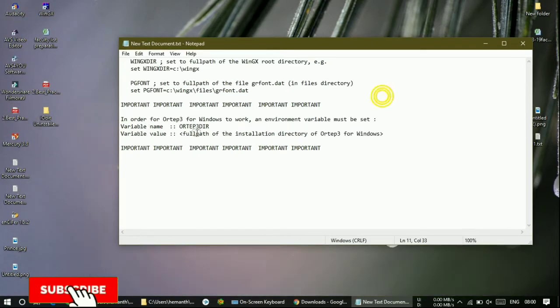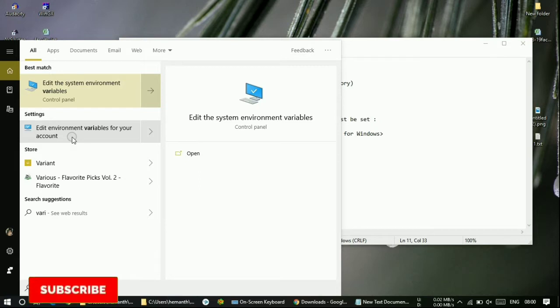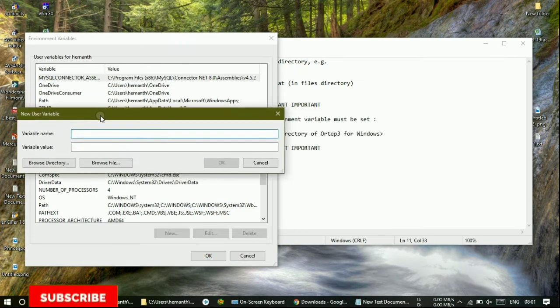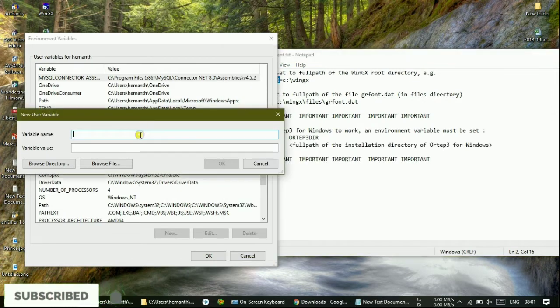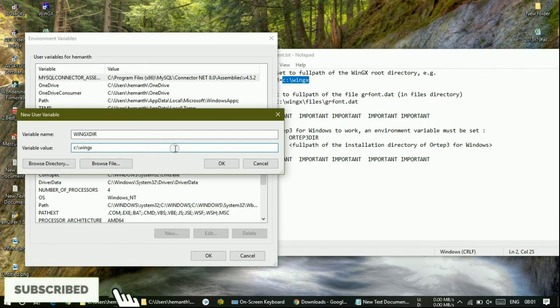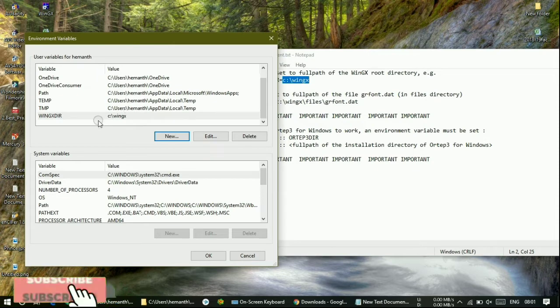To change environment variables, just go to the search button and type 'variable' — select 'Edit environment variables for your account' and click onto this. If you are using Windows 7, the same thing applies. You will get a window like this. Just click the New button — it will ask for a variable name and variable value. The variable name is 'wingxdir'. Copy and paste that name, then set the path of the directory. Click OK — you will get the variable added here.